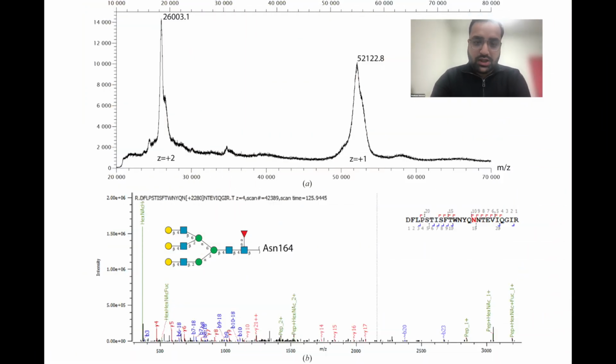So what they did was they already did extensive molecular dynamics. They looked at Ramachandran plots for carbohydrates, and they managed to make 64 constant glycans. So these are the only glycans that you can add. You can't just make your random glycan, so you are saved from doing all these complex calculations yourself. Rather, what you do is you do mass spec, like we have done. We know that we have a glycan with like 13 sugars on top of it.